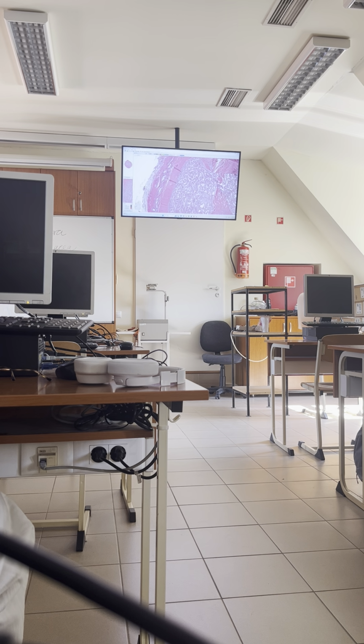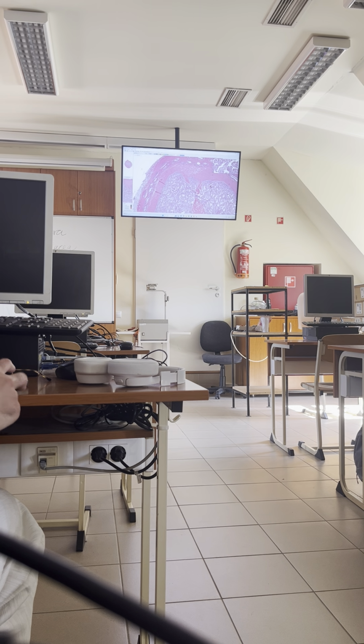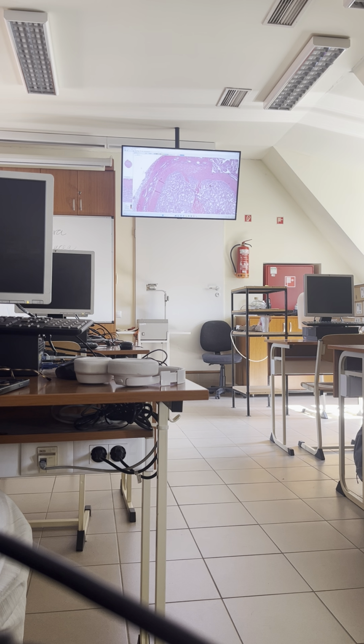These are ganglia? Or cells? No. How do I see the difference between the ganglia and just nervous cells? Maybe a stupid question. A ganglion is a collection of ganglion cells and nerve fibers. Well, this is first semester material. I know, maybe, yeah.